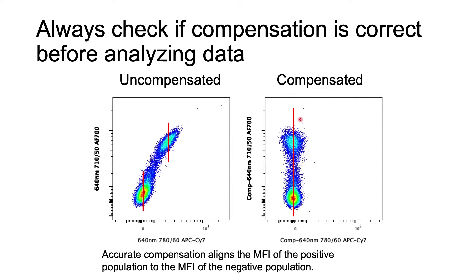If these populations are not aligning like this plot shows, then that means you probably have issues with the compensation that need to be addressed. I'll put some references in the YouTube description box to help you properly set up automated compensation tools and troubleshoot compensation issues.